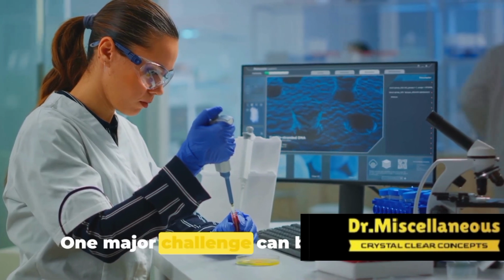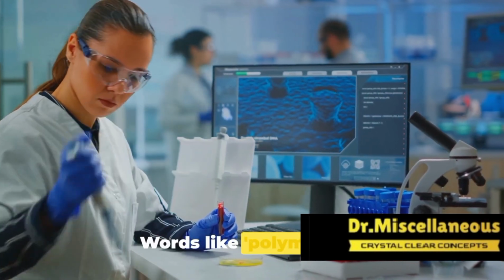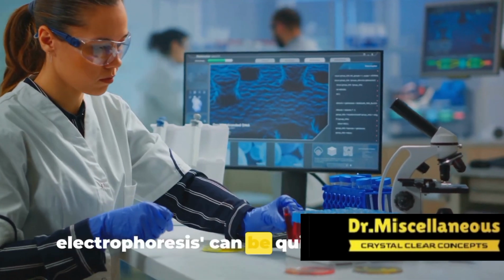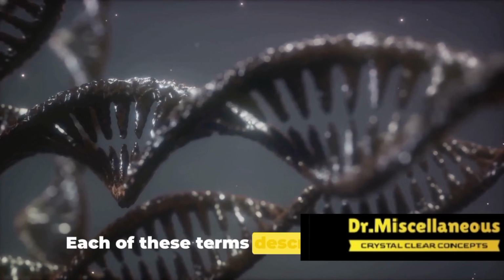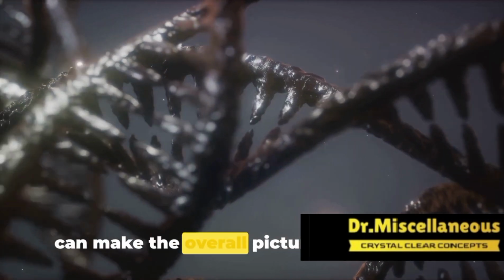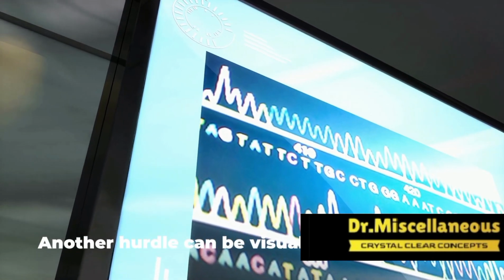One major challenge can be the technical jargon often used to describe it. Words like polymerase, deoxynucleotide, and capillary electrophoresis can be quite intimidating. But don't let this discourage you. Each of these terms describes a specific part of the process and, once understood, can make the overall picture much clearer. Another hurdle can be visualizing the process.